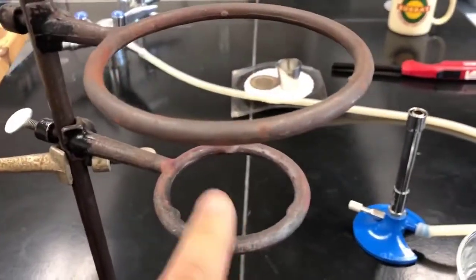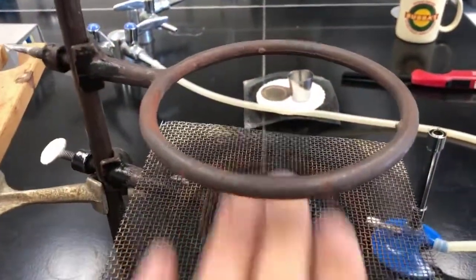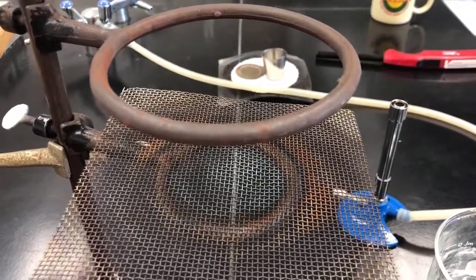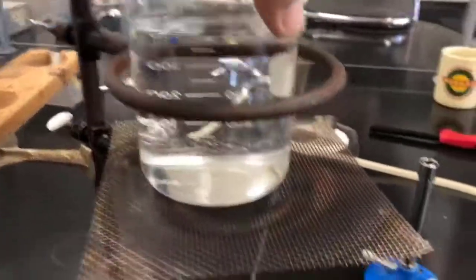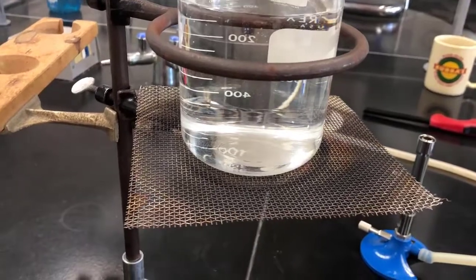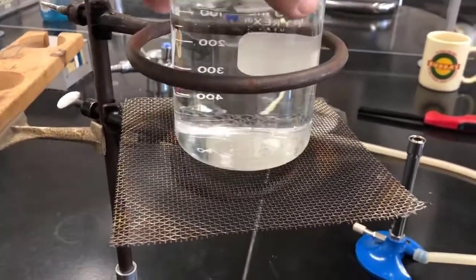And then the wire gauze — I like to use the one that has openings in it so that the heat transfers more efficiently. When you look to see the positioning of the top ring, the top ring position is approximately halfway up the beaker, and that keeps it from falling out should it get jostled.